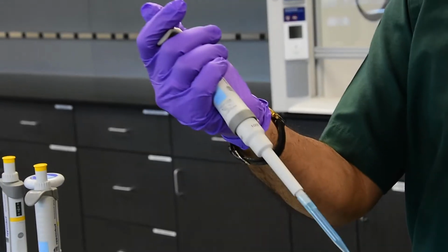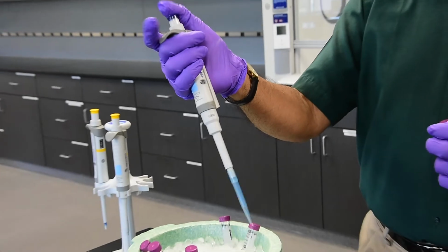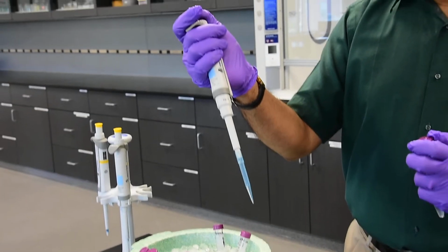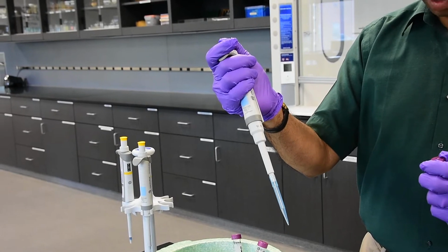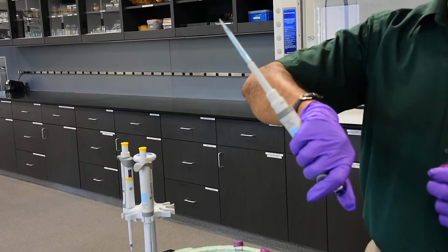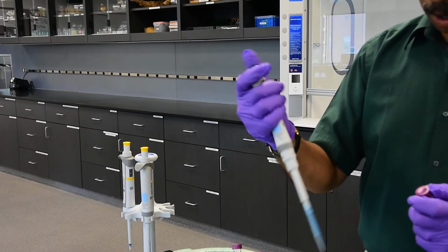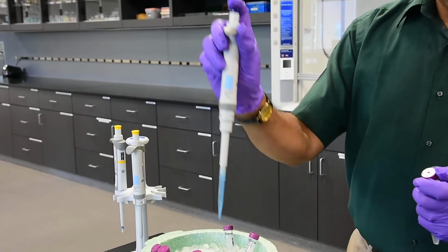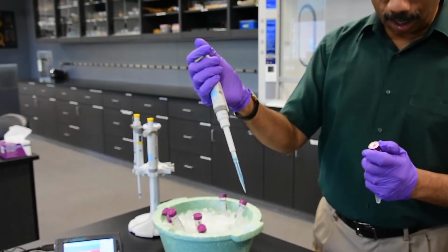Also, whenever you're using the micropipetter, you want to keep it at an angle like this and use your thumb to take the liquid in and to eject the liquid out. Don't ever do this. This is going to contaminate the micropipette. These are simple tips that you want to be careful about. Also, some students do this using their pointer finger, which is not efficient, so you get tired soon.